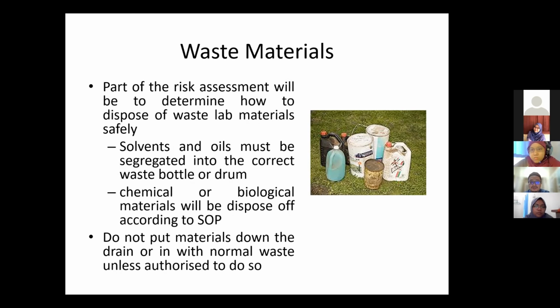Do not put materials down the drain or in normal waste unless authorized to do so. Not directly into the drain. There must be some SOPs on how to dispose of them. Maybe not in our lab, but when you are working or doing your research.